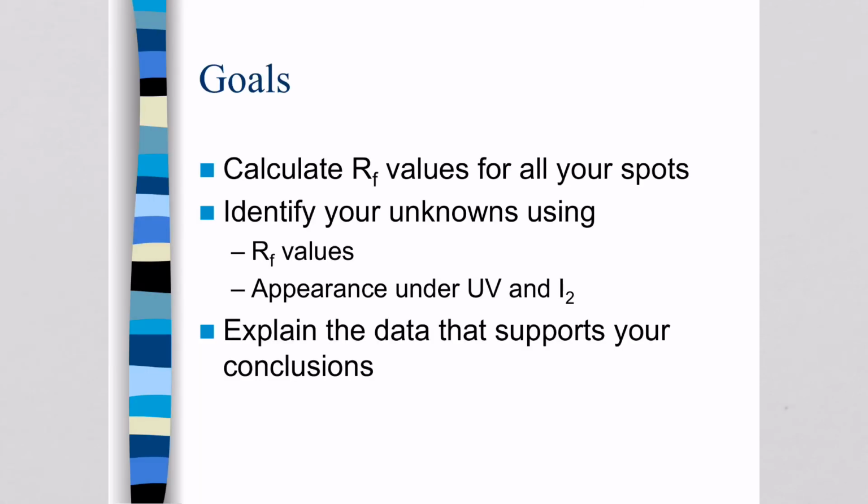Okay, so your goals for this lab are to get all your TLC plates and calculate RF values for all your spots. You're going to identify your unknown components using the RF values and using their appearance under UV and iodine. So those are all important things to have in your lab notebook.